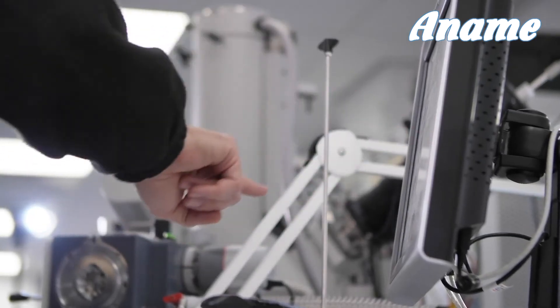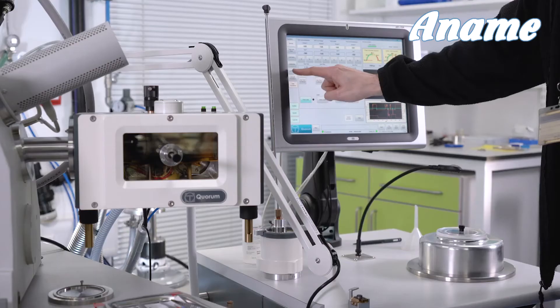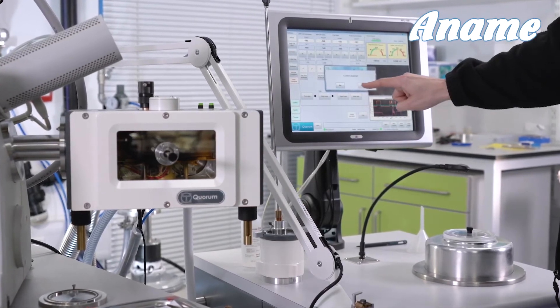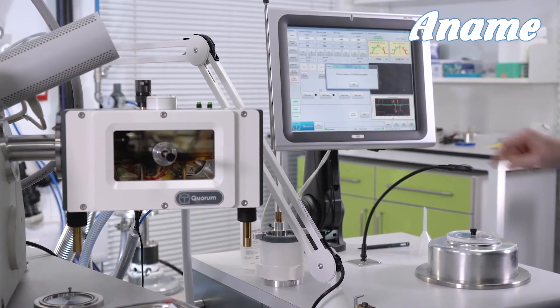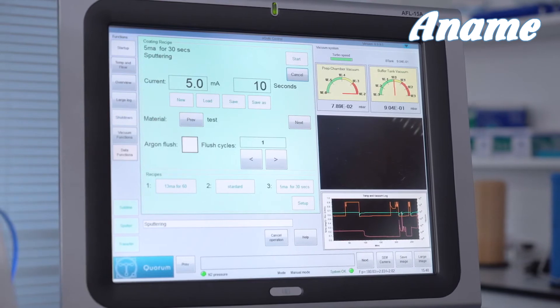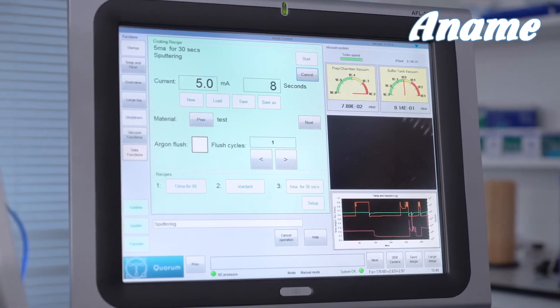Because the system is gas-cooled using plastic tubing, we can run the full 5kV stage bias capability with no problems with electronics. Because the system is controlled by a touchscreen PC, all parameters are continuously logged and saved to the hard drive. And if we can get an internet connection, we can actually run the system remotely from the factory for training, diagnostics, and software updates.